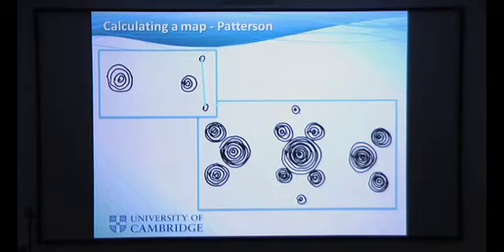If we look very closely, we can see an interatomic vector here between the two weakest scatterers. And this very vector can be found again here, pointing from the middle of the picture to the weakest spot in the image. There is a mirror image, or actually in the other direction, that same very vector.